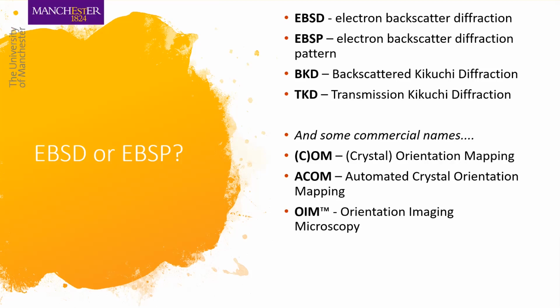TKD is a relatively new phrase that is more often used now, transmission Kikuchi diffraction, which I'll explain briefly as well. And then there are some commercial names which people tend to use, but not aware that these are actually not scientific terms. They're commercial names, such as OM, ACOM, OIM. So you need to be careful when you're using these in your publications interchangeably.